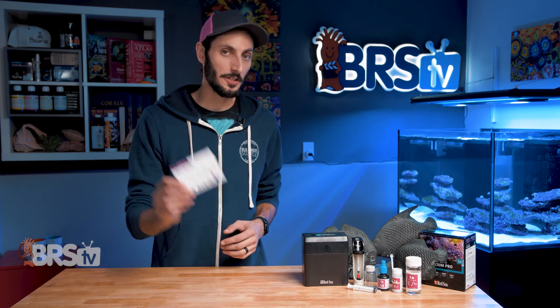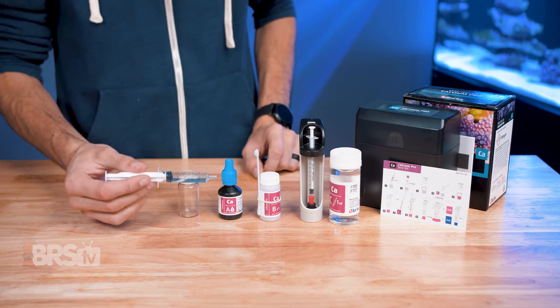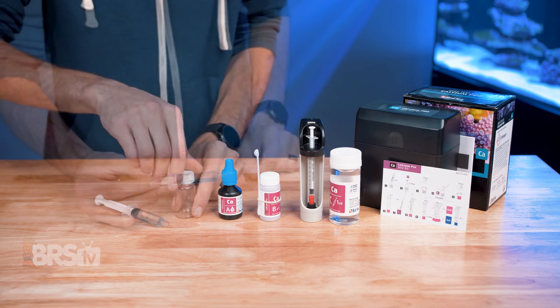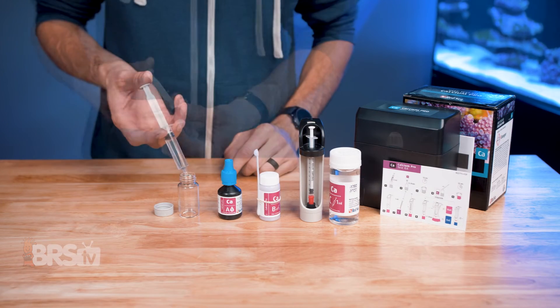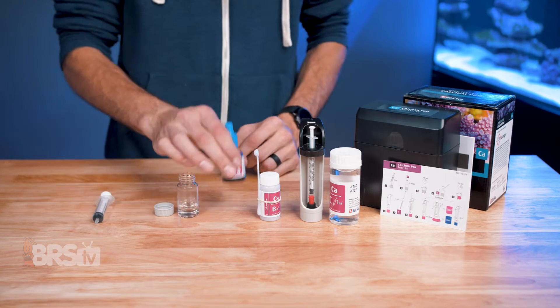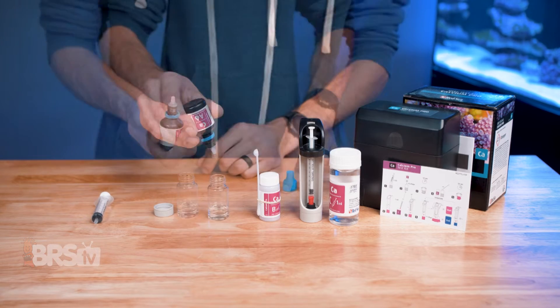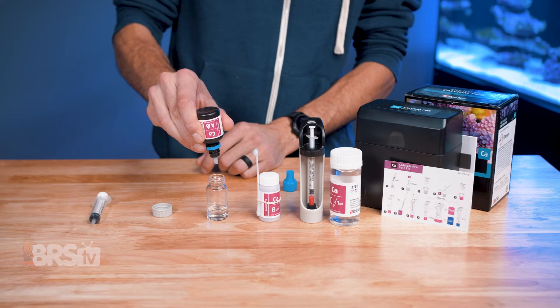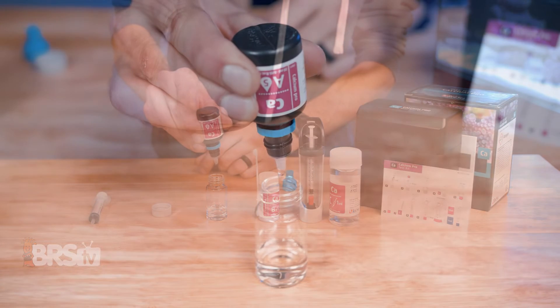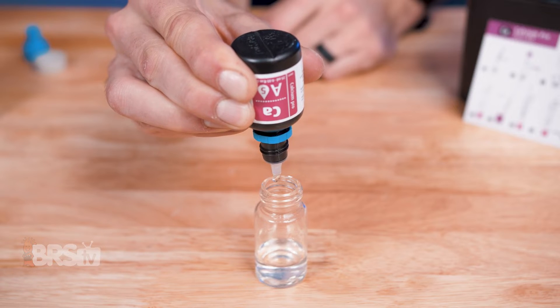The visual instruction card is really easy to follow. The test starts with five milliliters of sample water, which is more than many other calcium test kits, and that larger sample really helps to make sure you get an accurate reading test after test. The dropper bottle for reagent A is a quality dropper, and being able to get five consistently sized drops without accidental squirts or extra drops is one of the reasons this test kit is easy to get consistent results with.